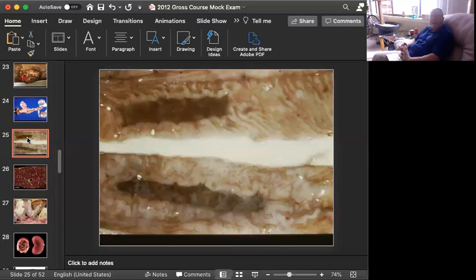Okay, time's up. I like this picture because whoever took this one many, many years ago, this is an oldie, got it before there was too much necrosis to sort of cover up what's going on here. We're looking at 2 sections of intestine, and the Peyer's patches are just gone. They are punched out. There's been diffuse severe lymphocytolysis. There are a couple of organisms that really go after Peyer's patches. Eventually, these organisms also lay waste to the regular intestinal mucosa. Catch them early, you'll just see the Peyer's patches.